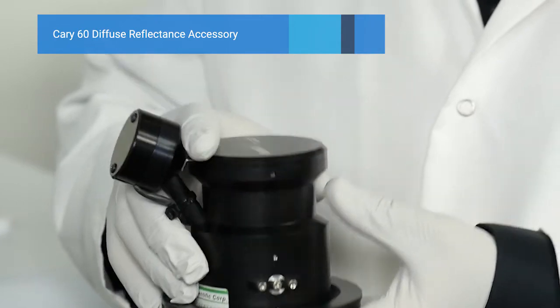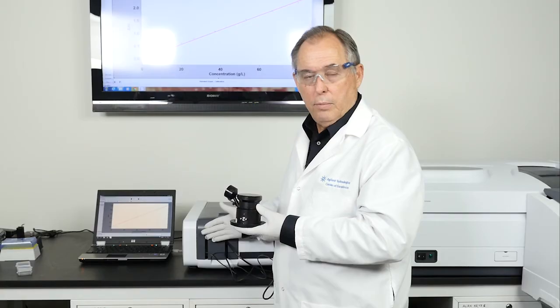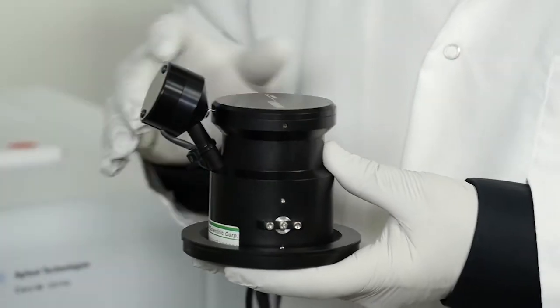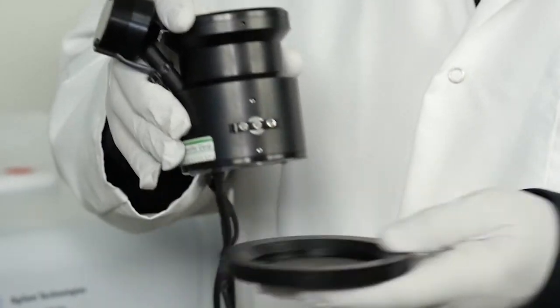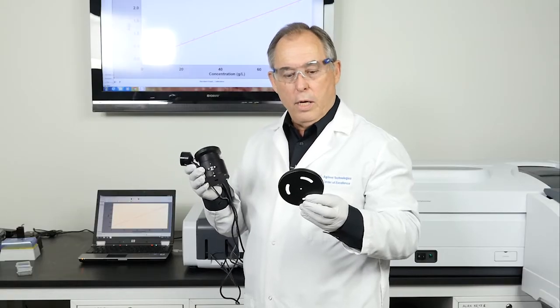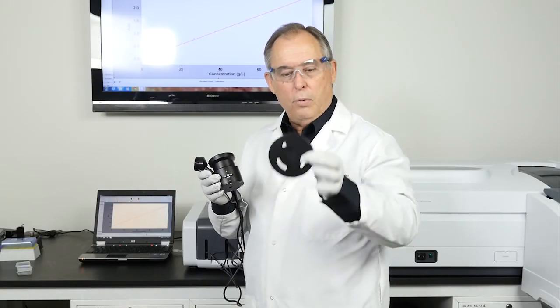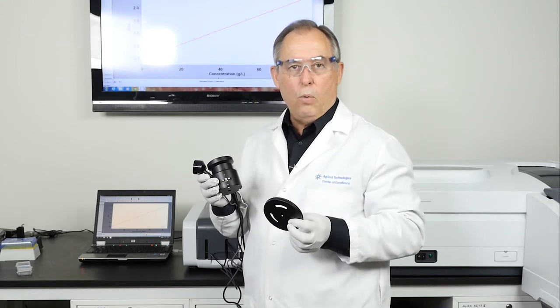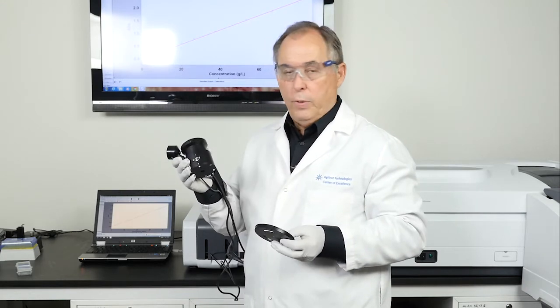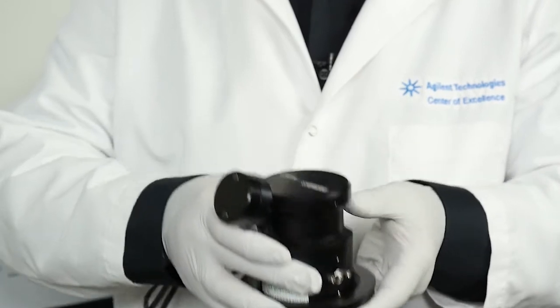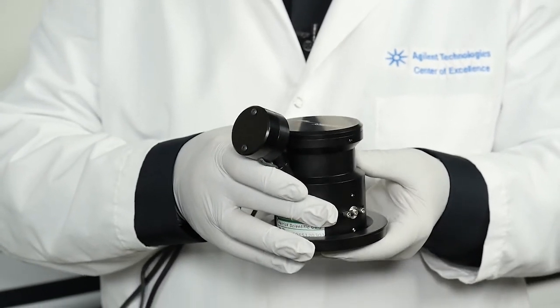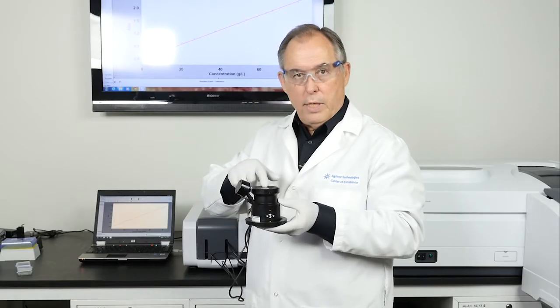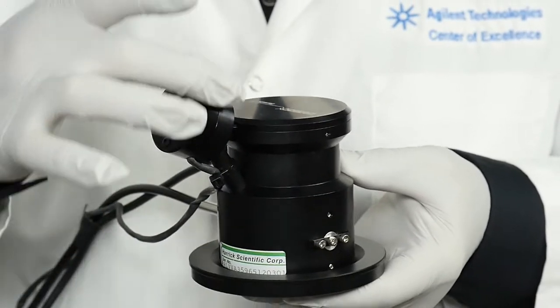This is the diffuse reflectance accessory. It hooks up to the optical system of the Cary 60. This is the alignment bracket, which we set the detector on. So we place this over the sample. The hole indicates where we are on the sample. And once we've done that, we simply put the diffuse reflectance accessory onto the bottom bracket. This is the detector, and this is the camera that will take a picture of it.